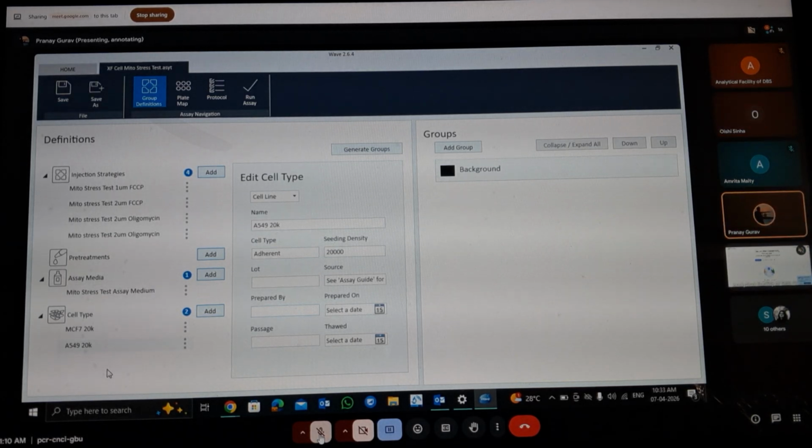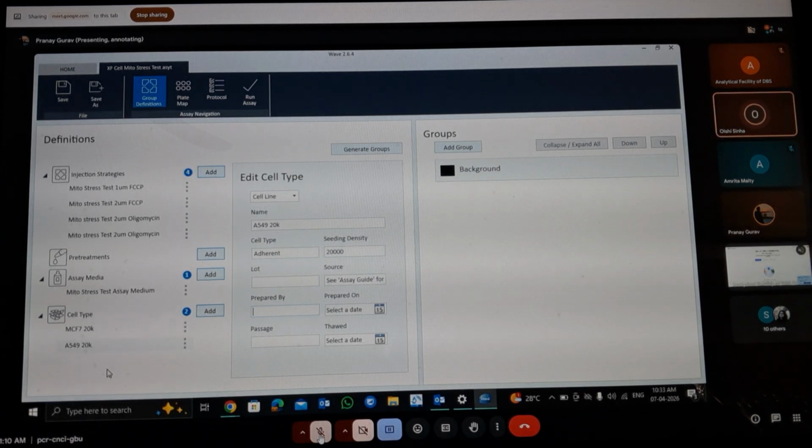Excuse me. Yes, I have a question actually. So here, what we are doing is that we are just taking adherent cell lines. So we are using the DMEM media, and we have written that we have taken DMEM media, right? When we were doing the dilution and solvent percentage and everything. Yes.